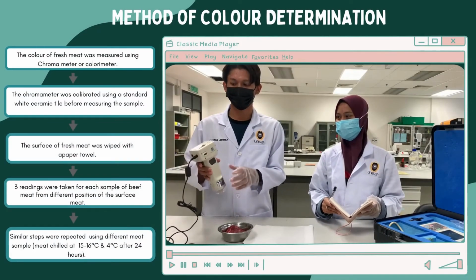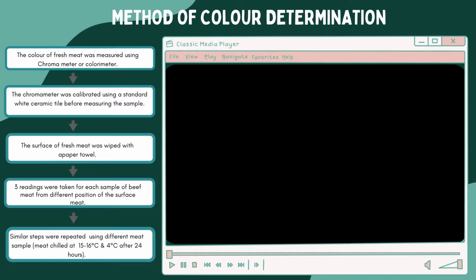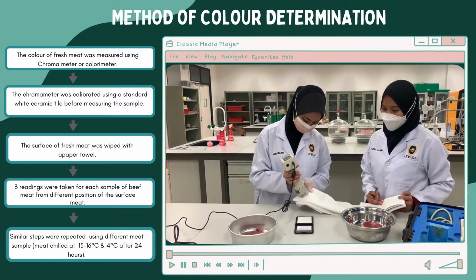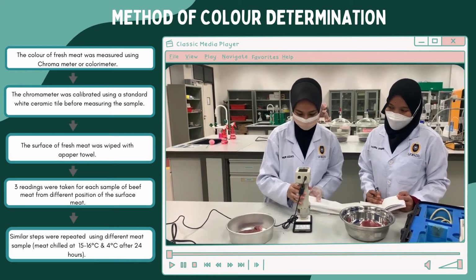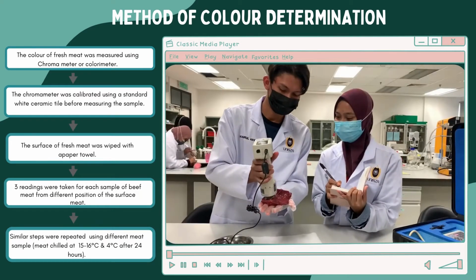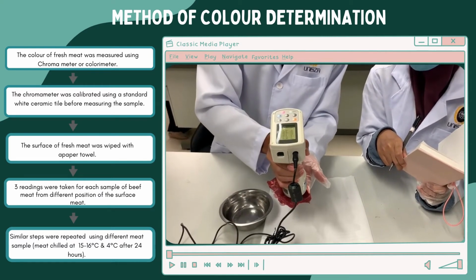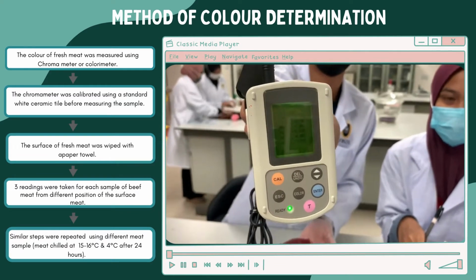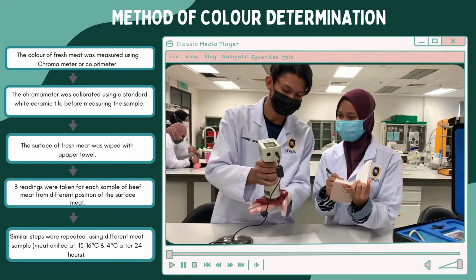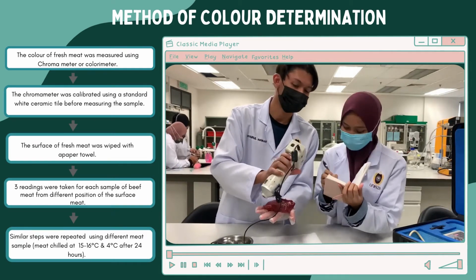Next is the method for color determination. The color of fresh meat was measured using a colorimeter. The colorimeter was calibrated using a standard white ceramic tile before measuring the sample. The surface of fresh meat was wiped with a paper towel. Three readings were taken for each sample from three different positions of the meat surface.